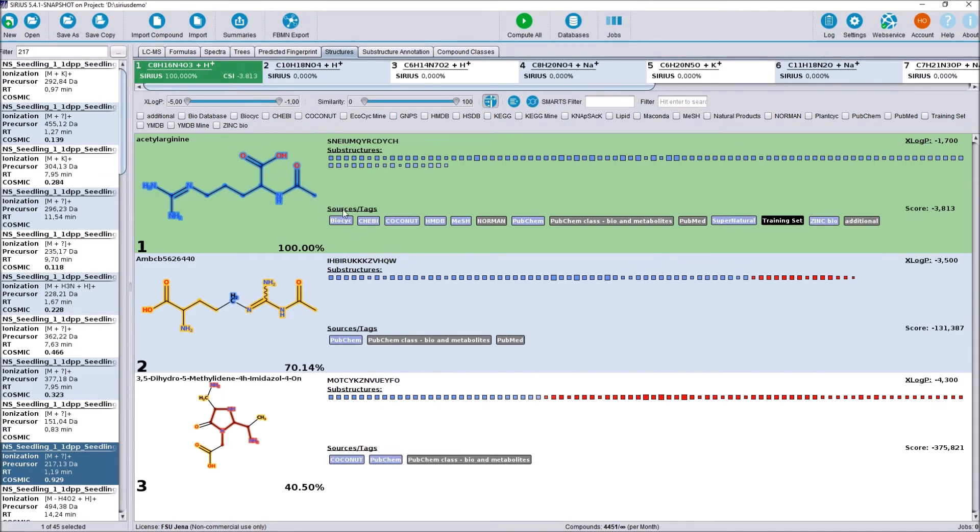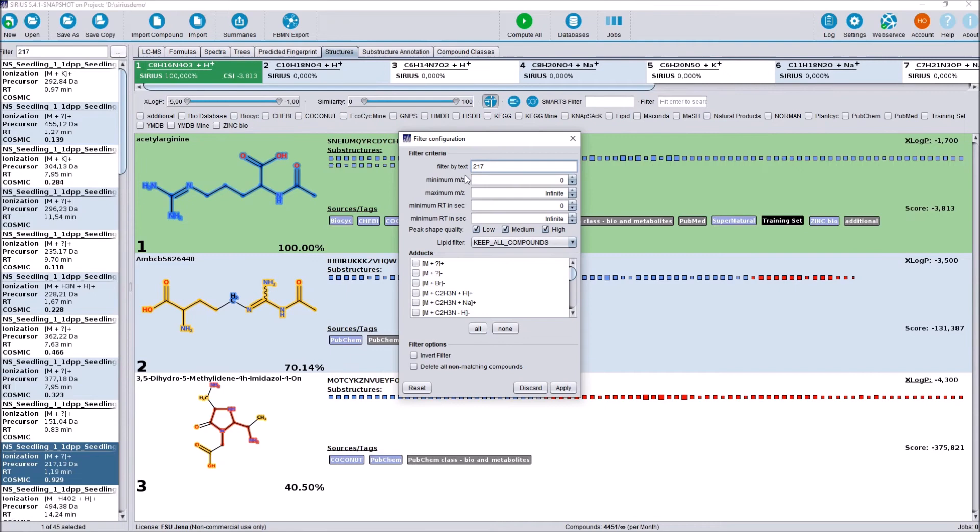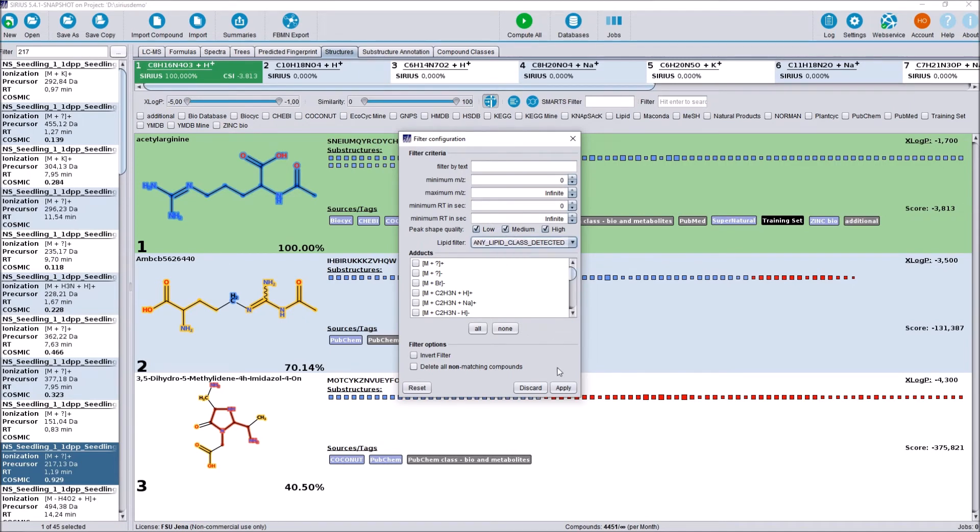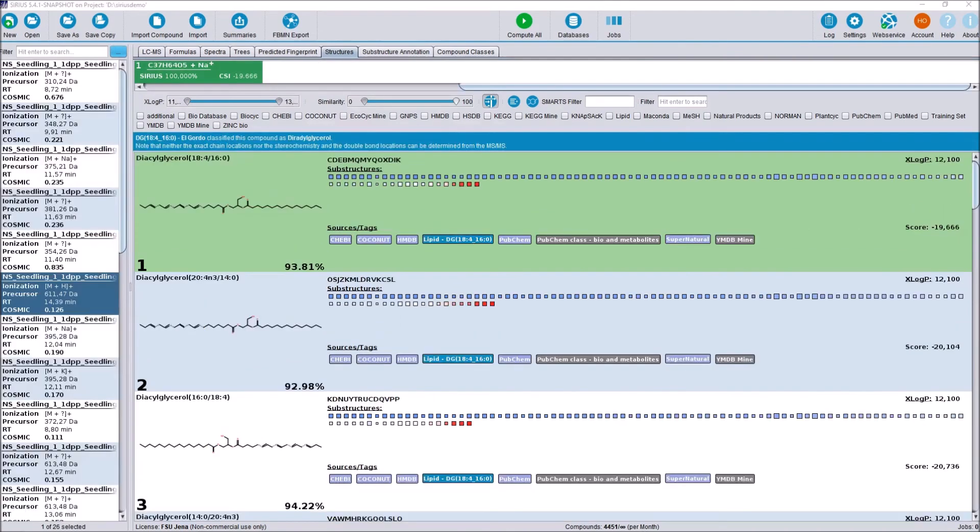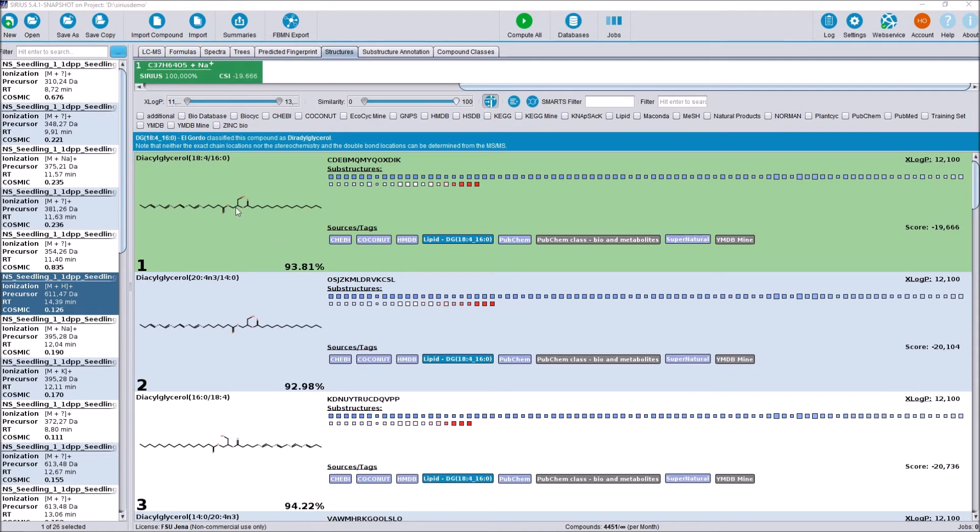What is new, however, in the CSI FingerID department is the new lipid annotation functionality. For that, we are going to go back in our compound filter here. And if you remember, at the start of the video, I briefly talked about this lipid filter here. We are now going to use that and set it to any lipid class detected and filter. As you probably know and can see here, lipid structures are often extremely similar to one another, varying by, for example, only the position of the double bonds.